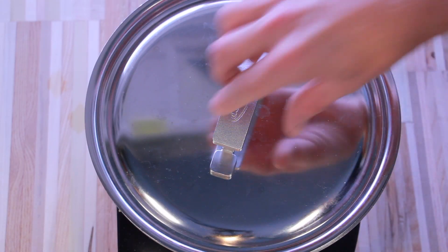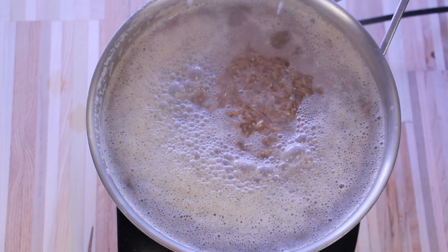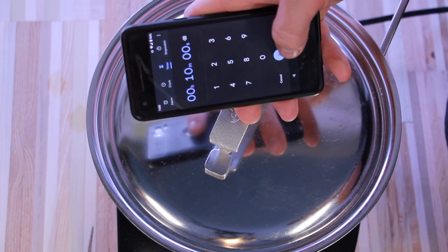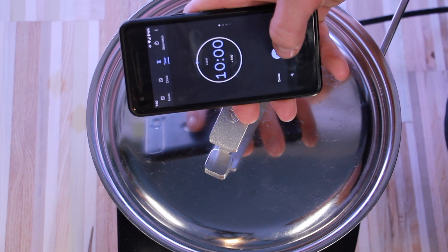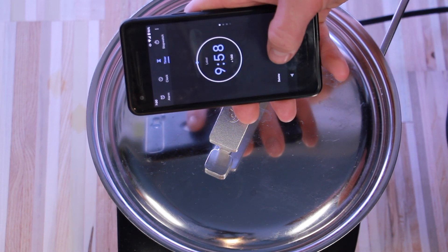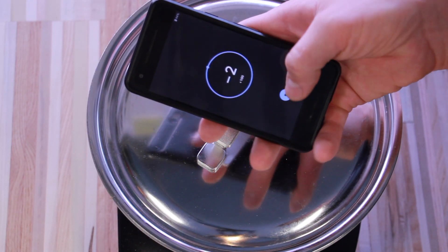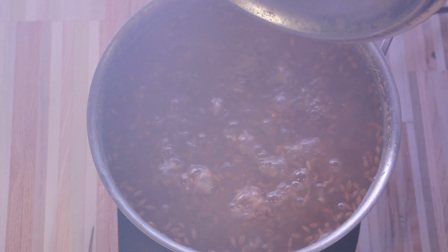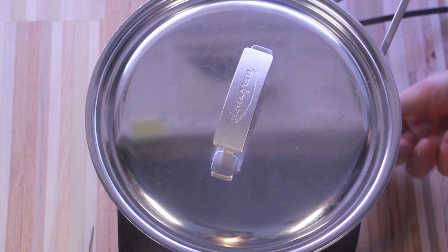And just like that, it's boiling thanks to the magic of editing. We're going to let it boil for 10 minutes. You just want a low simmer — it doesn't need to be a violent boil. Turn your heat source off when the time is up.